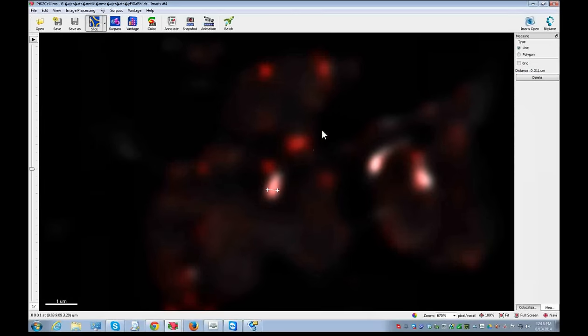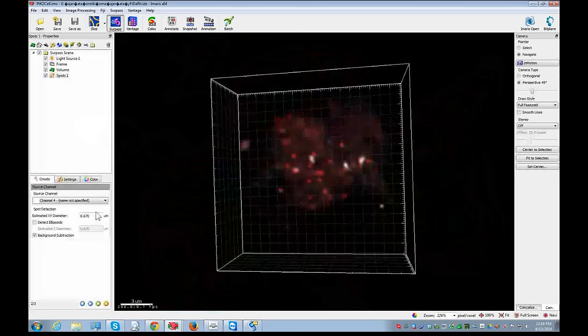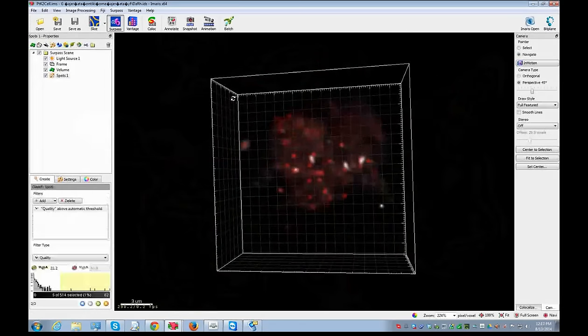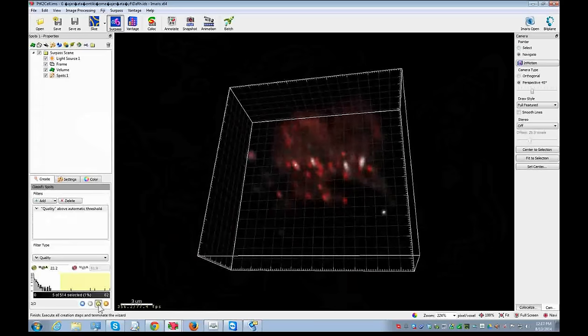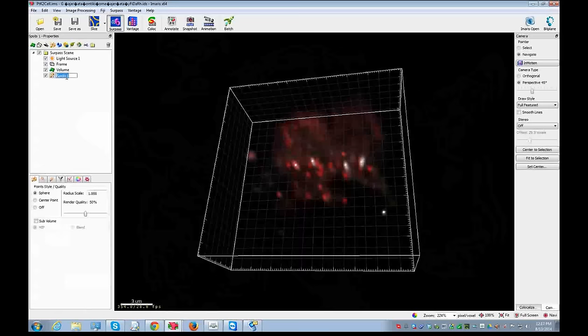Oh yeah, sure. I guess we'll start with the... well, I'll set up two sets of spots, and then we'll show them how we can do both. So these white spots are about 0.2, 0.3 microns. So we'll do 0.3. So we'll find these white spots first. Looks like we've done a fairly good job of finding them. So I'll go in and name these.